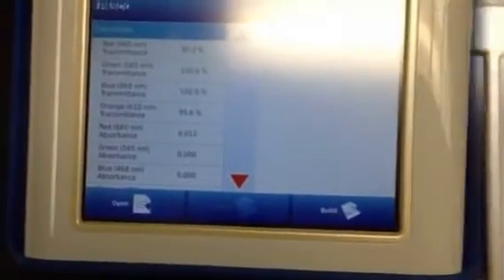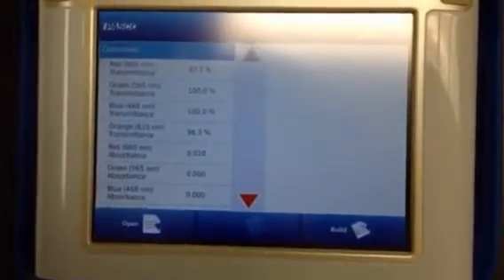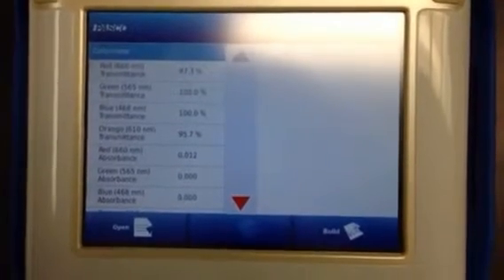The on-off button is on the bottom. Once it's plugged in, you turn it on, and it will — excuse the glare — provide you with this screen right here. Once your colorimeter is connected to the Spark and you've turned on the Spark, you'll see this screen.